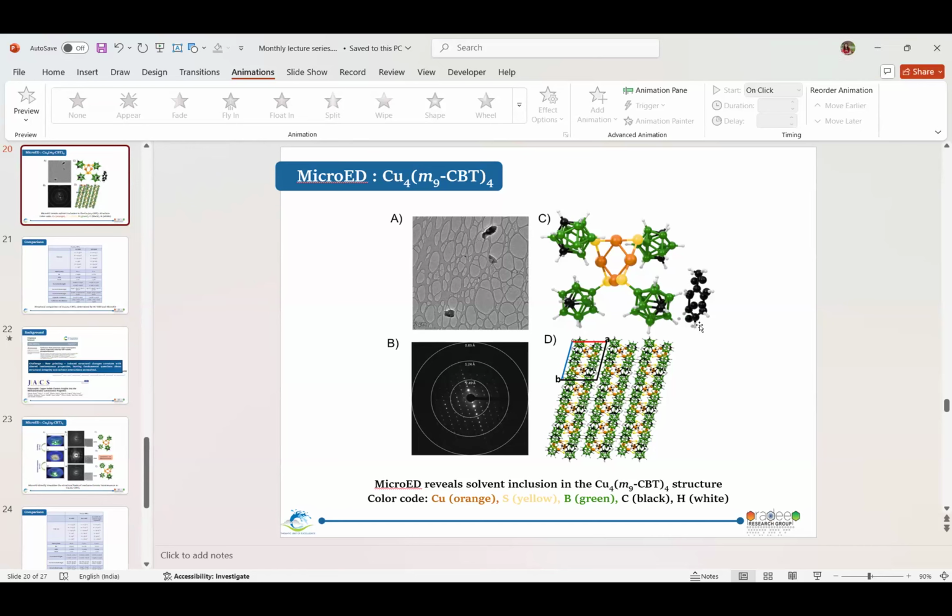I think they have physical significance, please check. I think it is about how much penetration can happen, like the interplanar distance. Even I'm telling the physical significance is about the diffraction spots and the distance between them. No, you are asking about the concentric rings only. Sujan, I think that is correct. It's about how much resolution you have. You have the beam spot, and how good the diffraction is. I think the bigger the ring, the better the resolution, the better the planes.